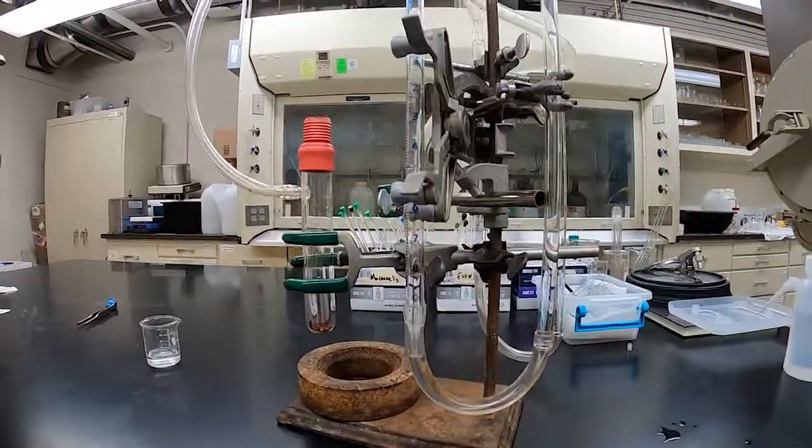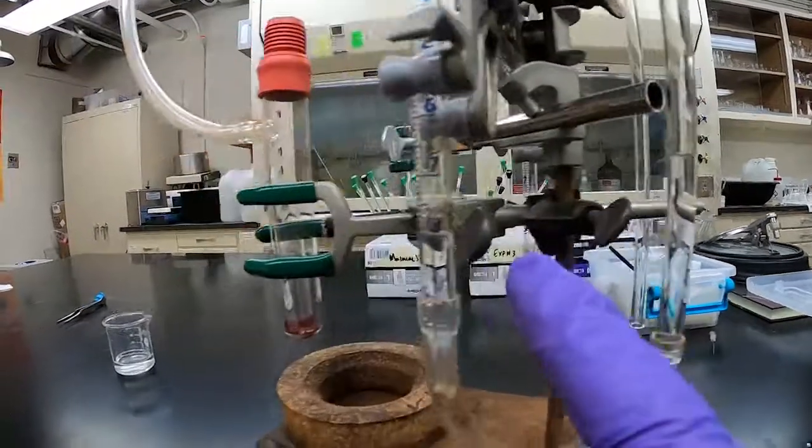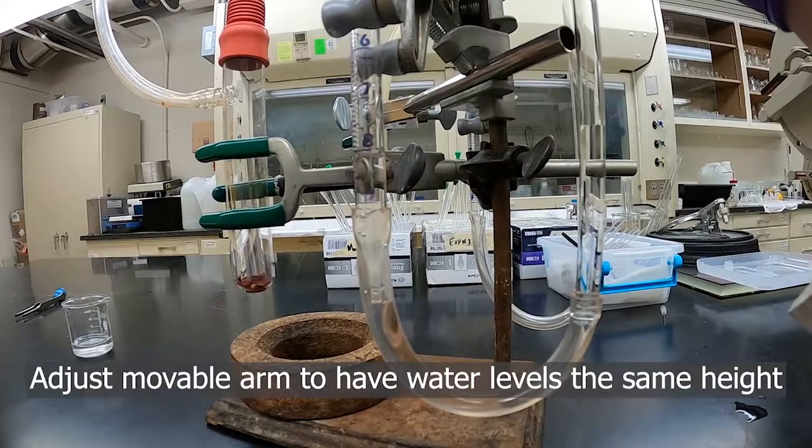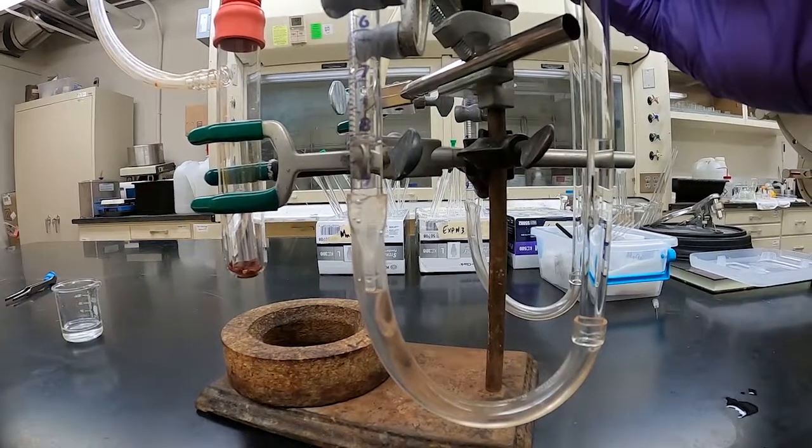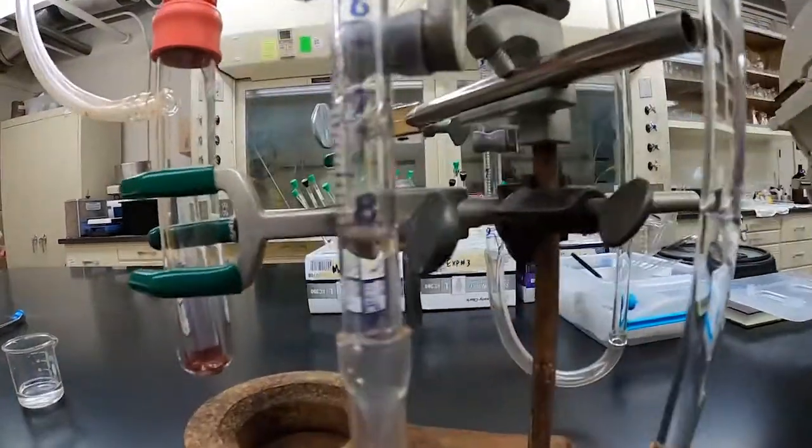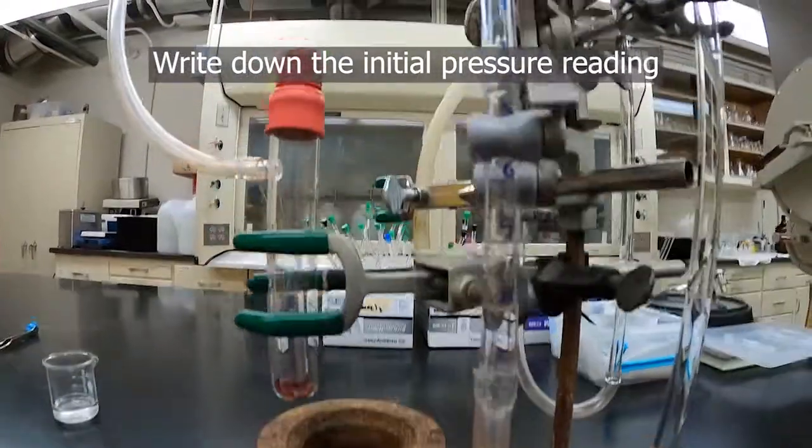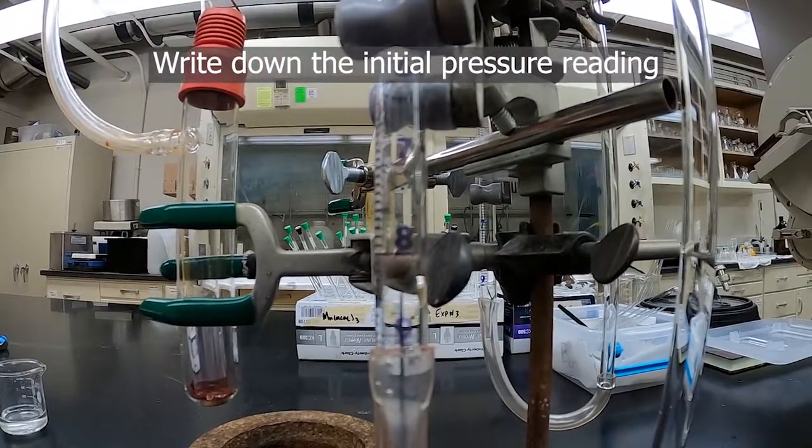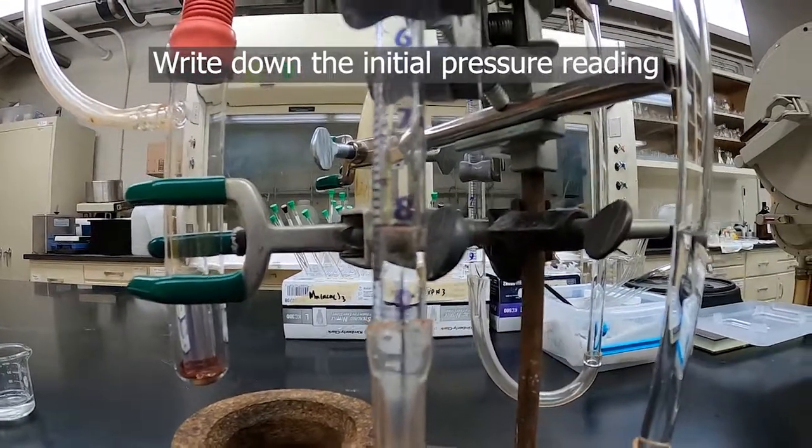So we clamp our sidearm tube in this clamp here on the side. The water level in the movable arm is about here, and on the graduated arm it's at 8 right there. So we want to adjust the height of the movable arm so that they're the same, which will tell us that the pressure inside our tube is atmospheric pressure. Right there looks pretty good to me. It's like 8.12 milliliters, 8.11 milliliters.